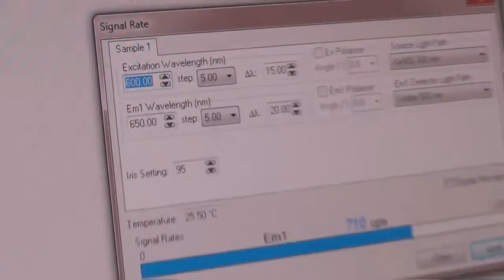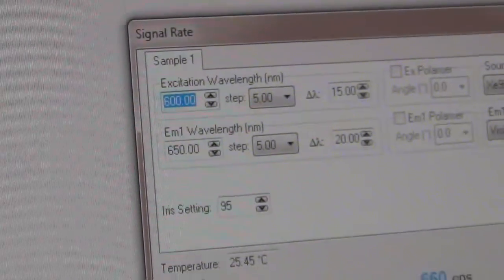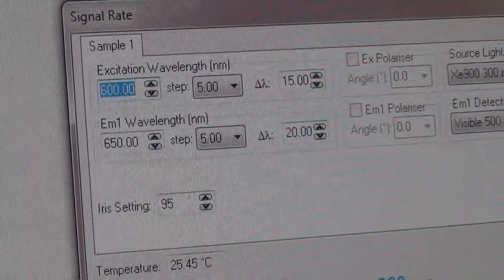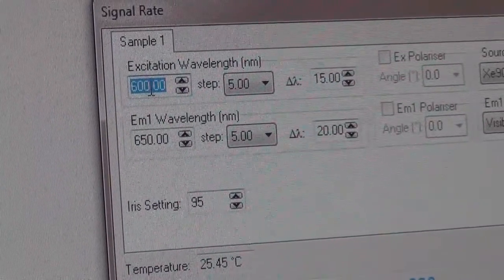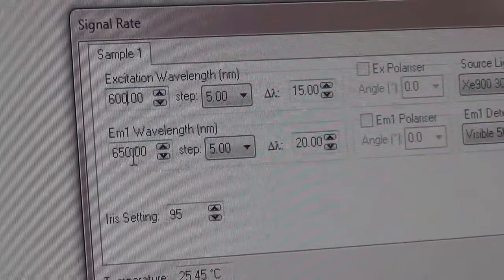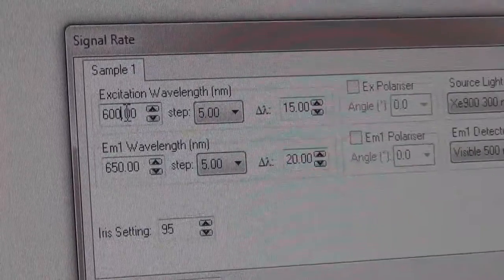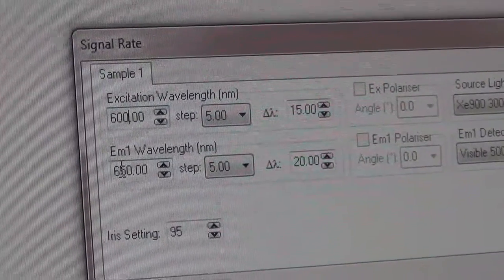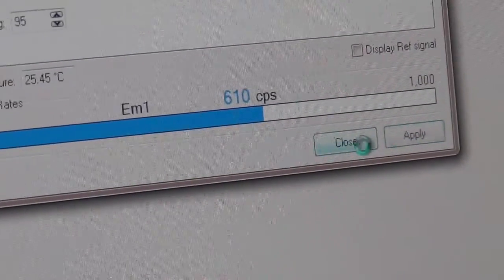You need to key in the wavelength. So maybe this is an example, and just put 600. You need to check. If green is 600, yes, let it be 600. And emission wavelength, if your determined wavelength is 600, it is advisable to put higher than 600, maybe 650. So that will be okay. Just click apply and close.